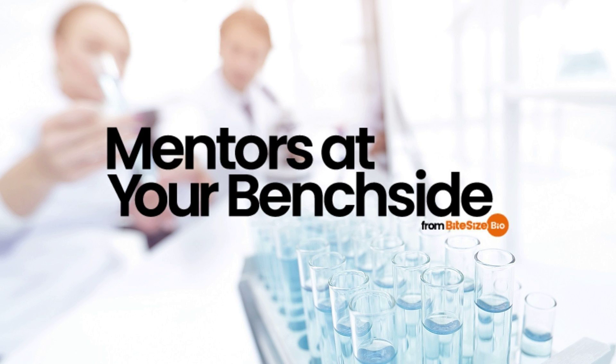The strength of this method lies in its precision and reproducibility. It's used to assay protein content in food, soils, wastewater, and fertilizers. Hazardous and time-consuming, however, the Kjeldahl method requires at least 1 gram of sample, making it highly impractical for most molecular biologists, especially if, like me, you struggle to produce microgram amounts of your protein of interest.